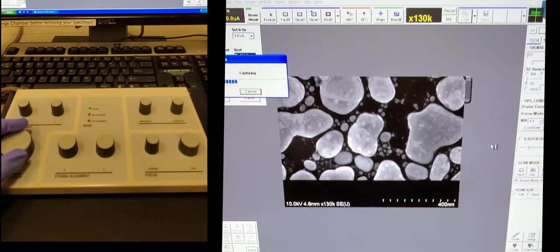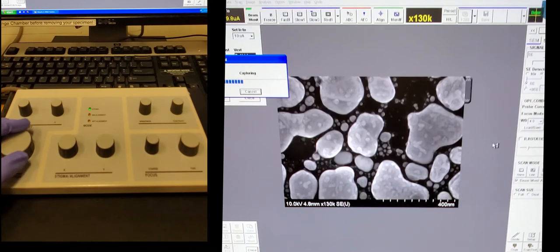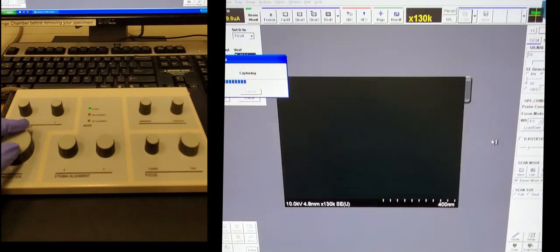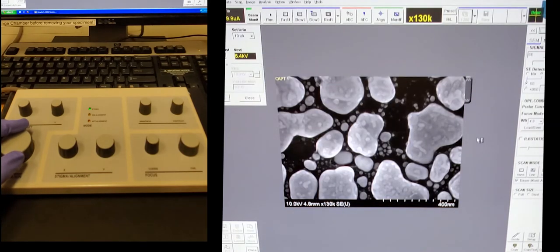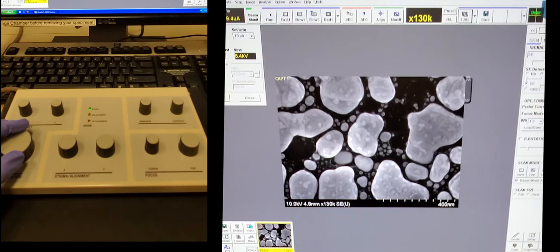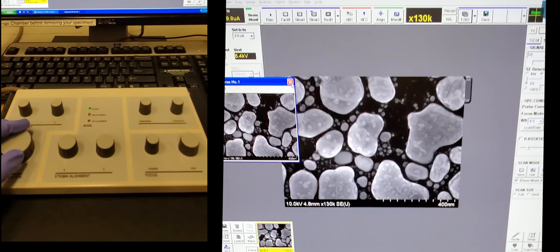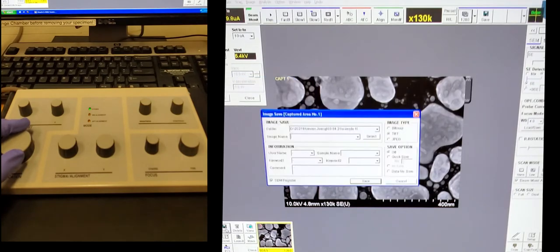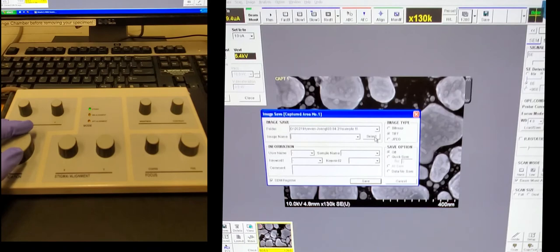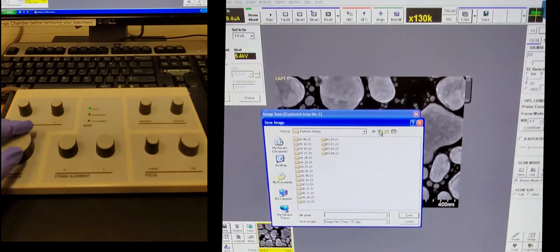So when you think about what's the best image, resolving the smallest details and then zooming back out will give you the sharpest image possible. And also try not to make the whole image completely monotone gray. Adding a bit of contrast makes the image actually look nicer and show the features that you want to show.